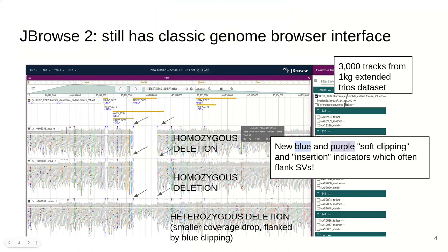New in JBrowse2 are these clipping indicators shown in blue, or insertion indicators in purple, which can be helpful for identifying precise boundaries of structural variants.